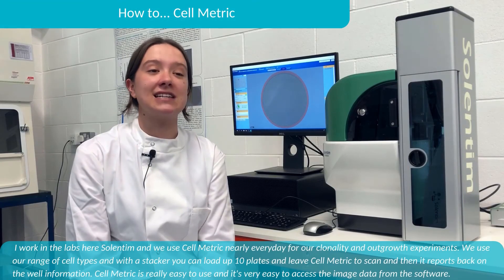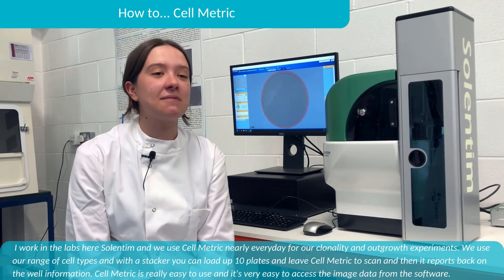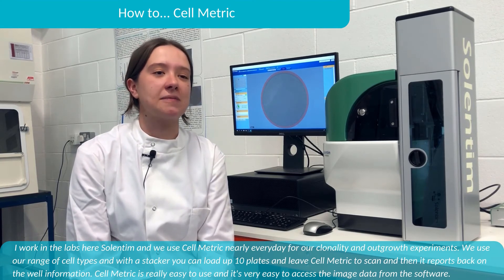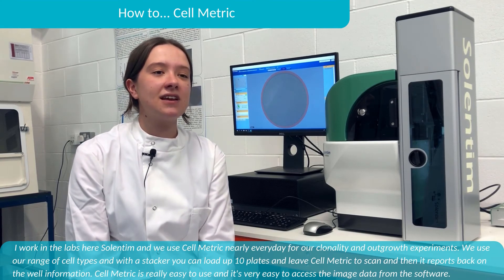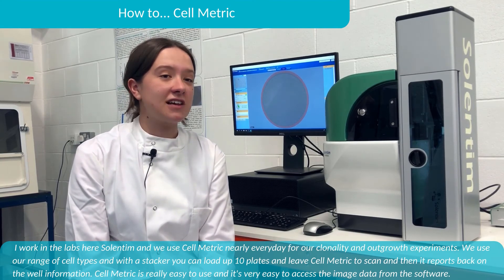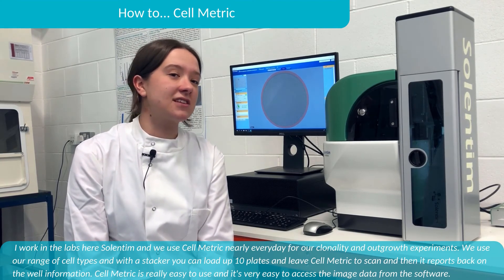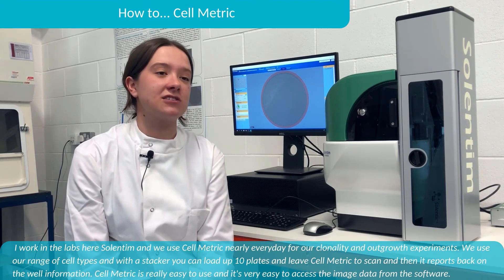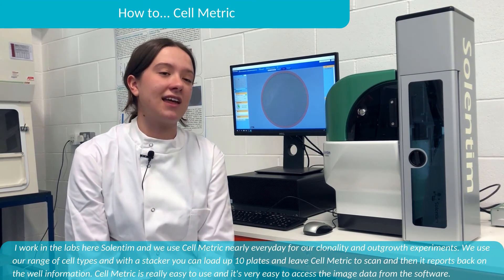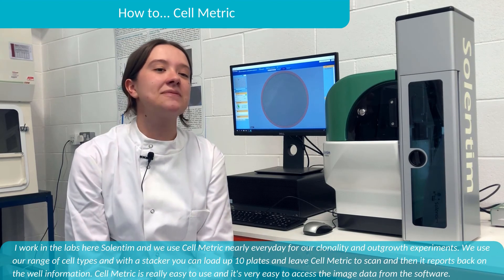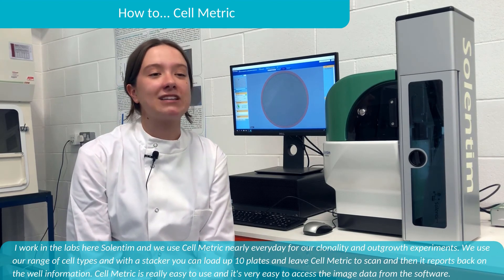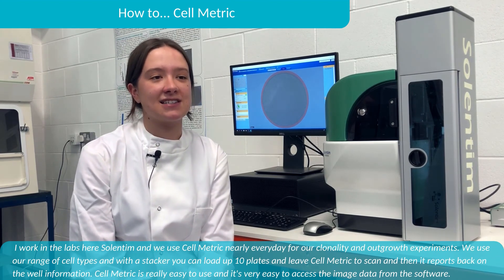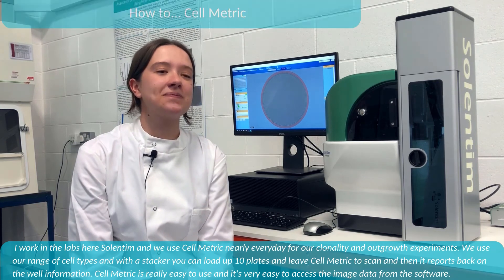I work in the labs here at Solentim and we use Cell Metric nearly every day for our clonality and outgrowth experiments. We use a range of cell types, and with a stacker you can load up to 10 plates and leave Cell Metric to scan — it then reports back on the well information. Cell Metric is really easy to use and it's very easy to access the image data from the software.